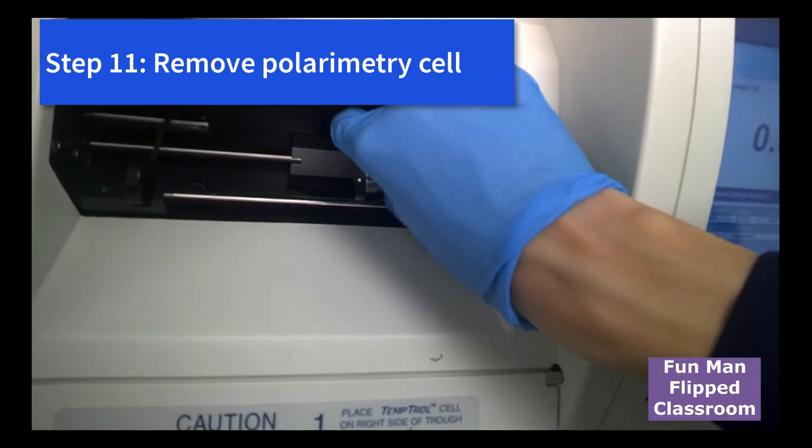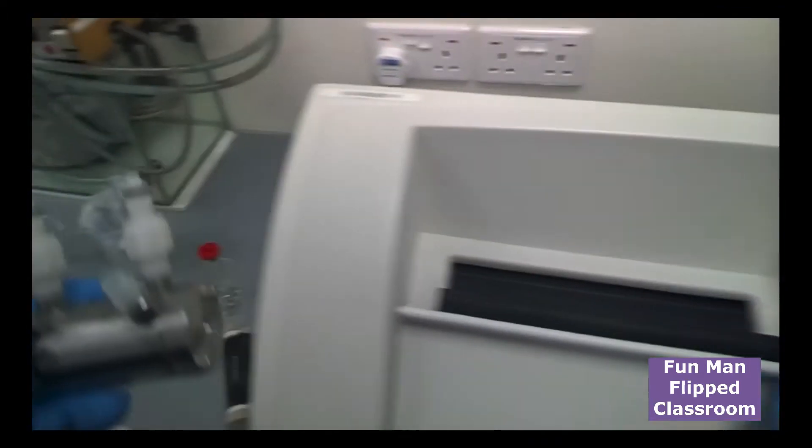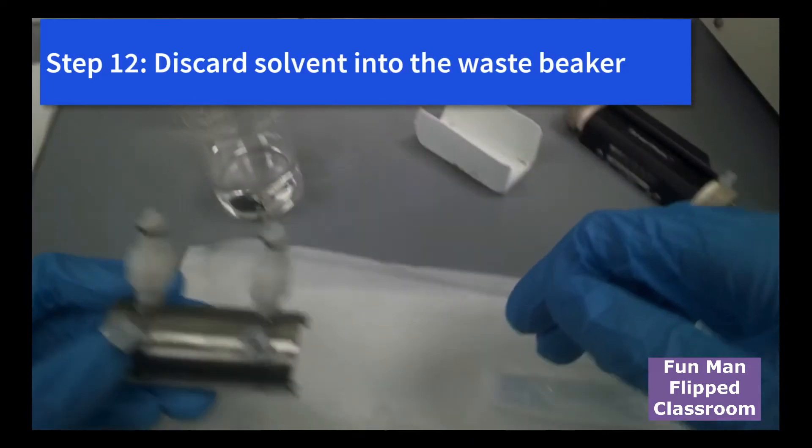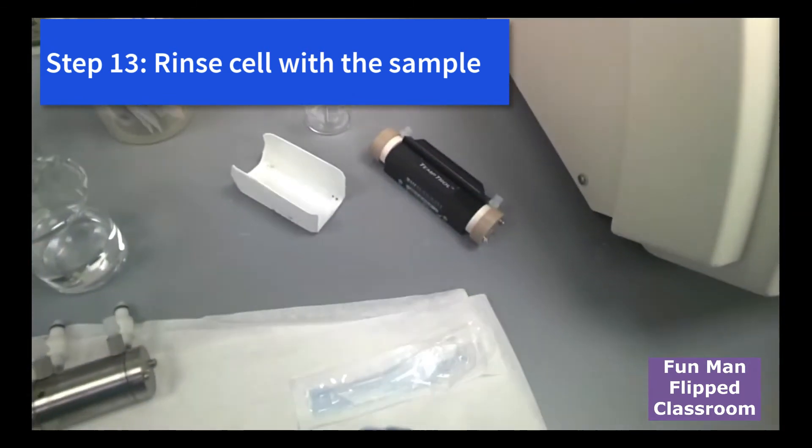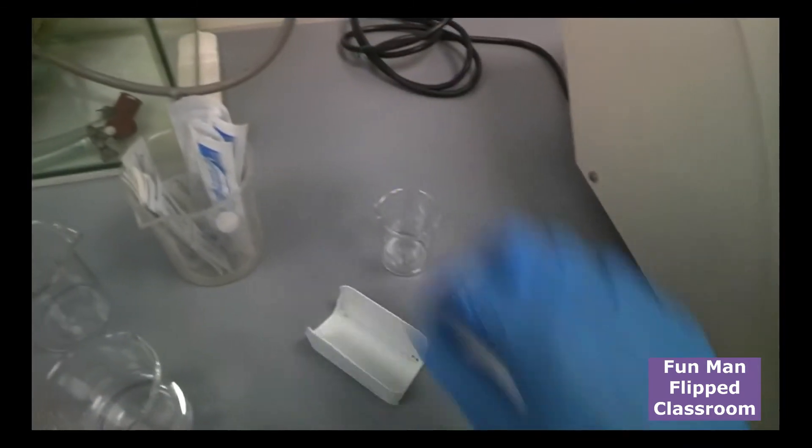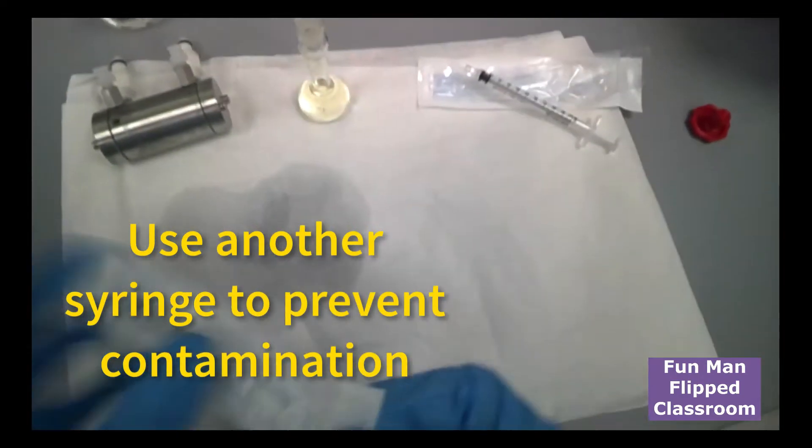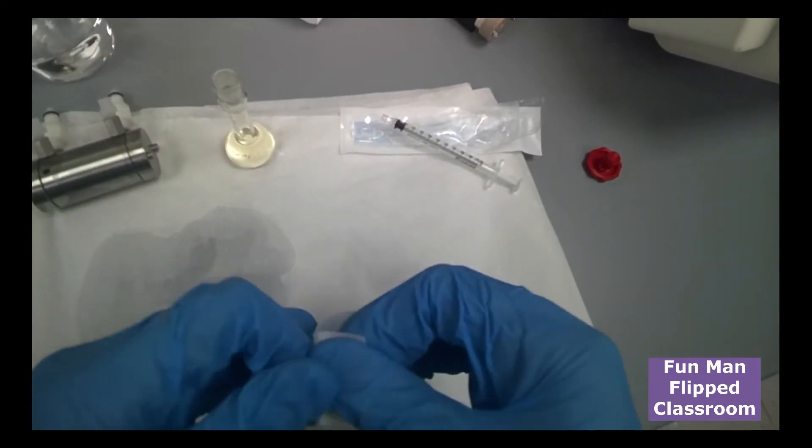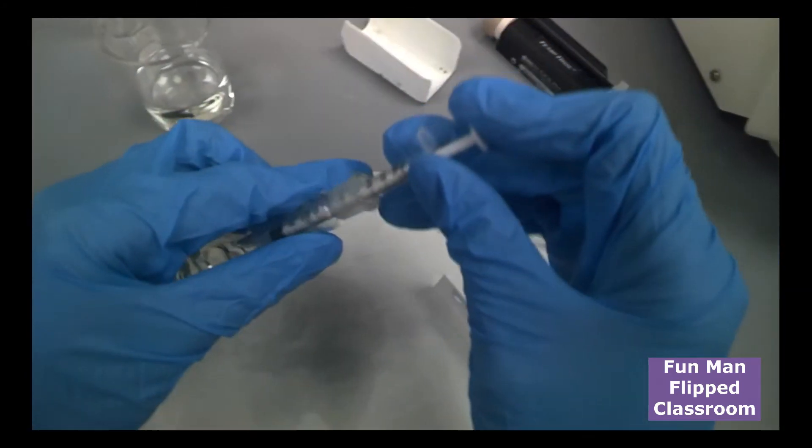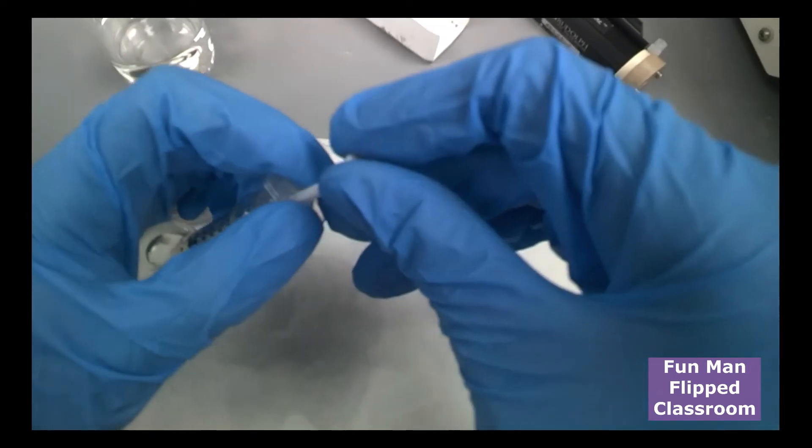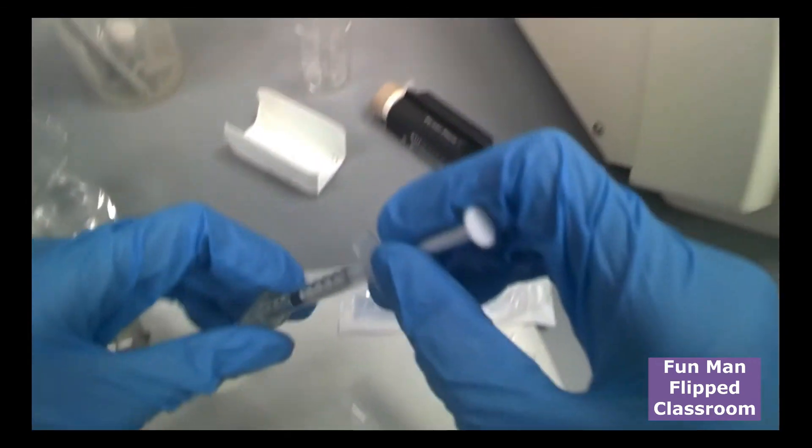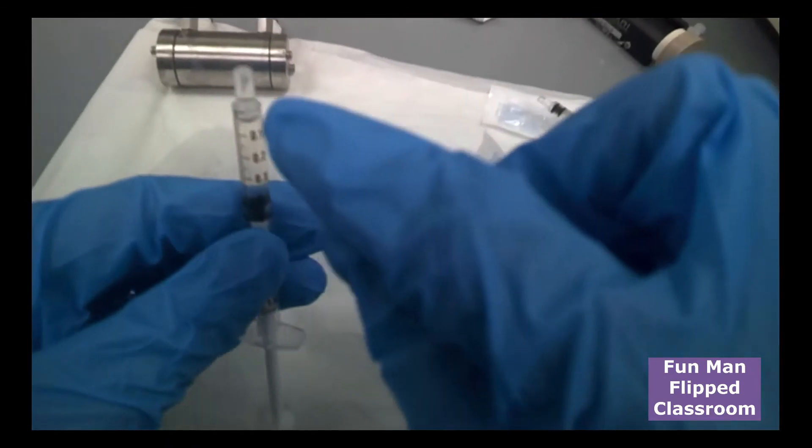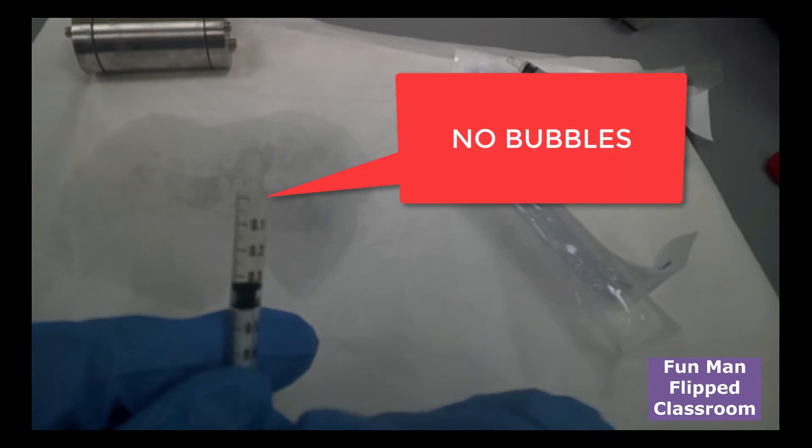So what we do now is we remove the polarimetric cell from the polarimeter. We should use a waste beaker here. Take out the liquid. And we will rinse it with our sample that's already prepared. So we will take out using another syringe. Again, the same thing. Insert. Make sure there's no bubbles.